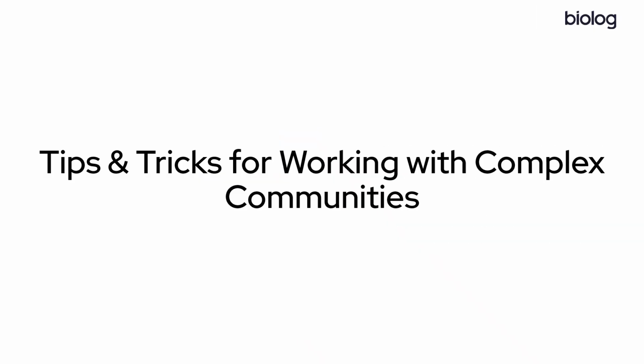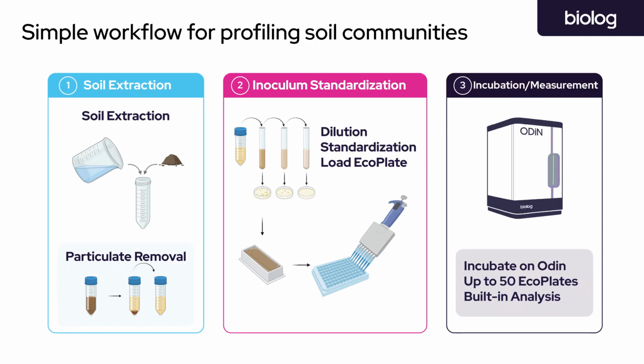Now, when working with complex microbial communities, sample preparation is critical, right? So let's discuss some more details around this. And so here's an example of a typical workflow for soil samples. But you can use this three-step approach for other samples, including aquatic sources or like extraction of tissue samples, etc.